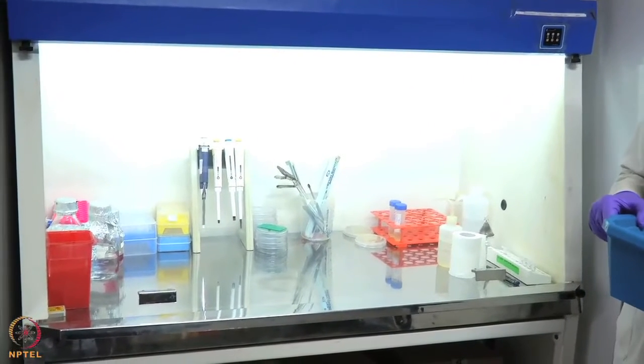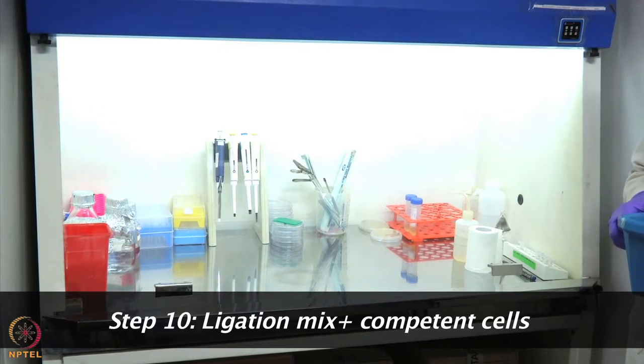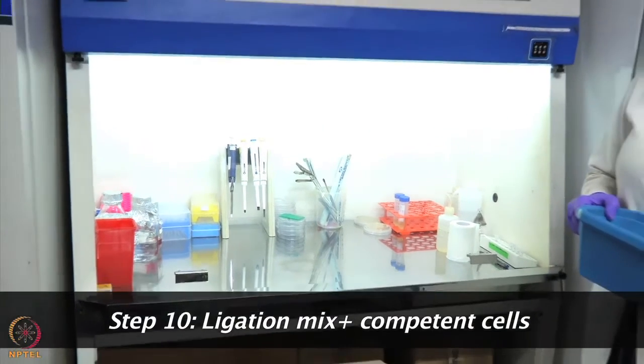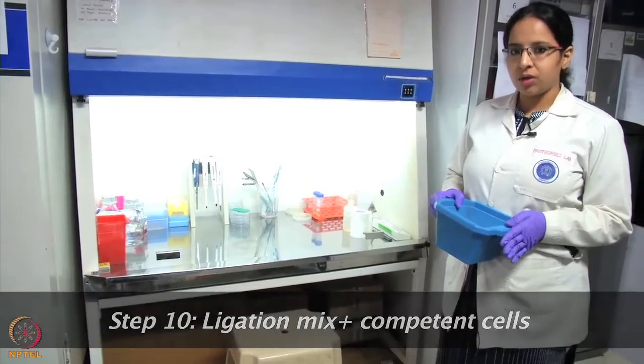Now we'll carry out the transformation experiment. So we have our ligated sample. We'll also keep a negative control, water. In all the experiments, we normally keep a negative control.